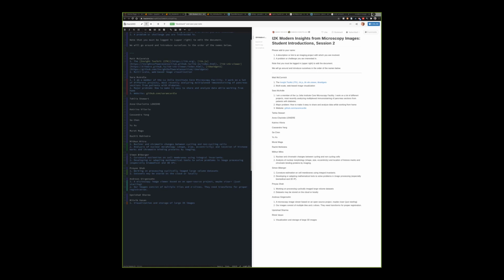I'm looking at how to integrate an open source project for doing that, and we'll probably do Vizarr, but it really depends on what common image format we standardize on, if it might be OME-TIFF, OME-Zarr, or something like that. One problem that we are going to have is that all our images have to be registered, and then we have to figure out how to do the best transform to make this registration happen.